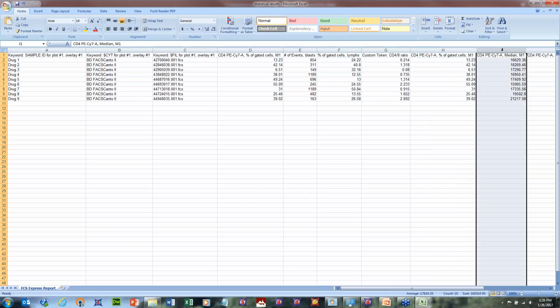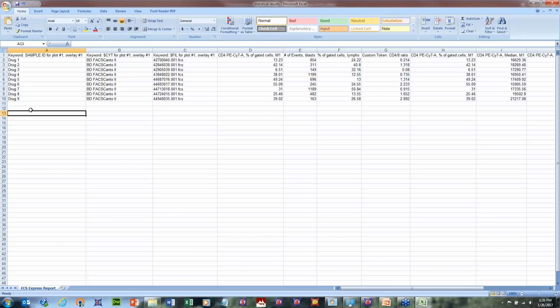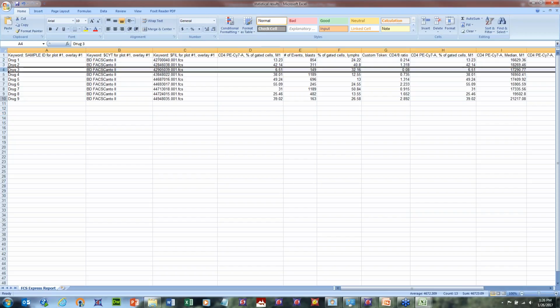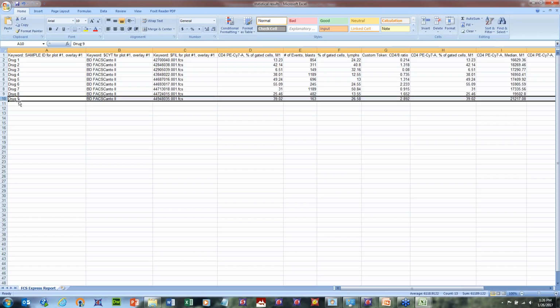Okay, so that's going to serve your needs in most cases. But like I said, I will talk about cell mode later if we have time. And you have one row of data for every iteration. Okay, so I have 9 rows of data.